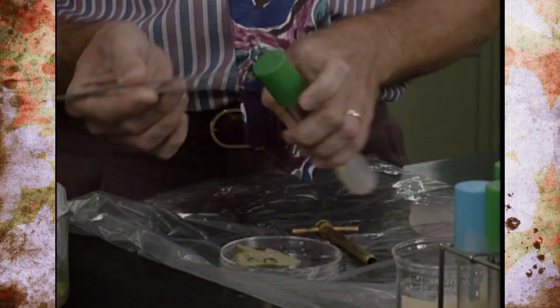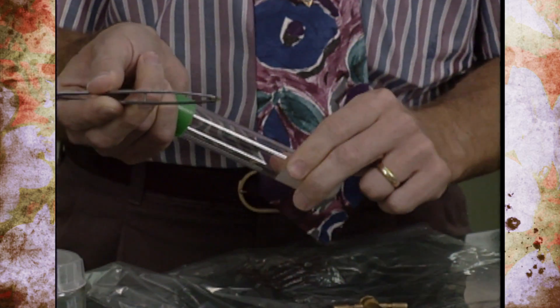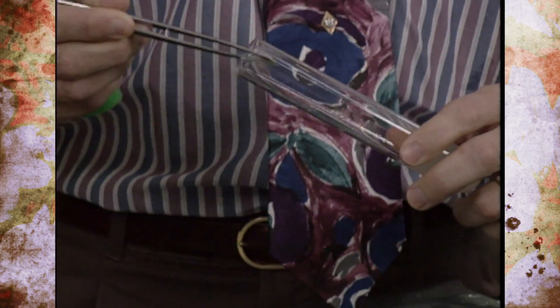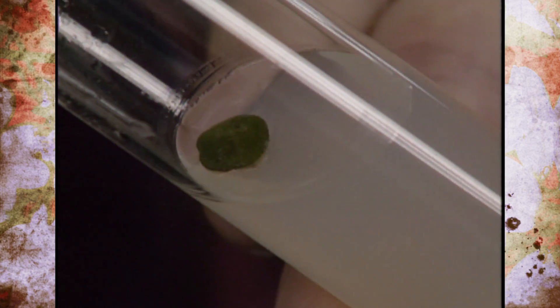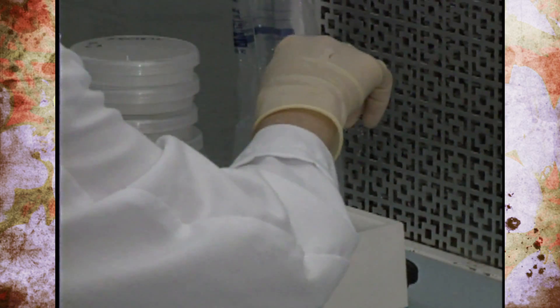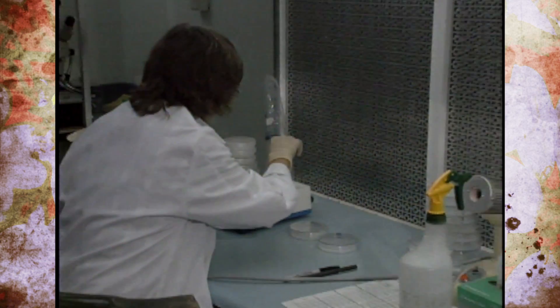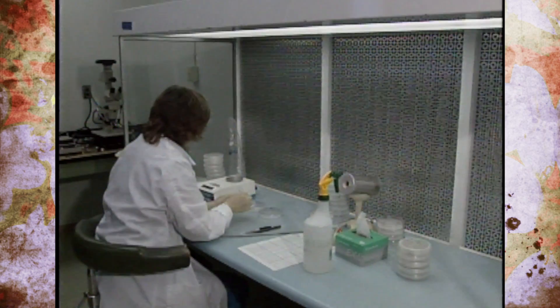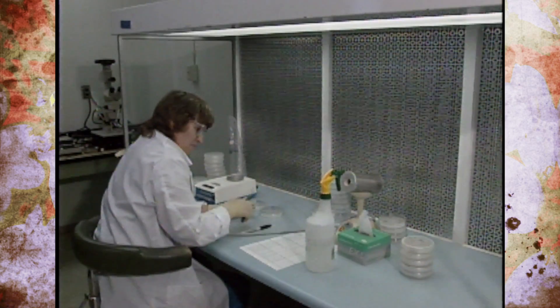Normally this process would be done inside the bag, but in a commercial setting it would be done in a laminar flow hood. The disc of tissue is placed right on the surface of the agar and capped. Laminar flow hoods provide a large desk space where the operator can freely move around and transfer materials, and they maintain a sterile environment by constantly filtering out all microbes.